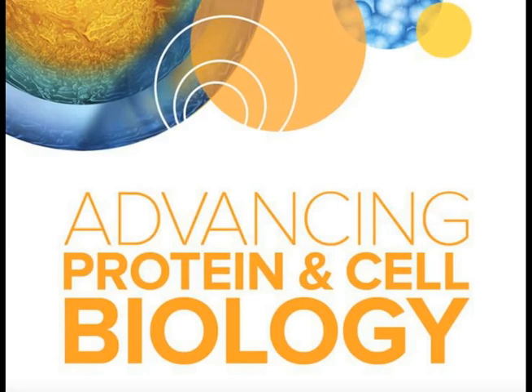Actually, there's a question I'm going to have Oksana answer. Have you done much immunostaining of the spheroids? So I've tried staining of spheroids, but with phalloidin only. I didn't try to stain for some other markers yet. It should be possible, but there may be some issues with antibody penetration, but we have not addressed it yet. It's in the future.